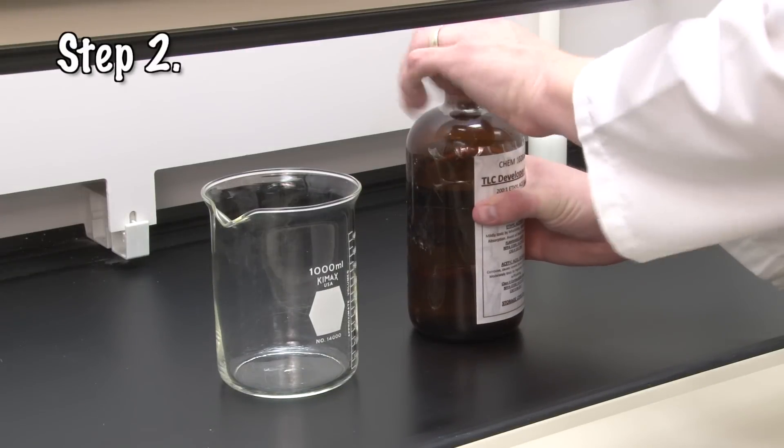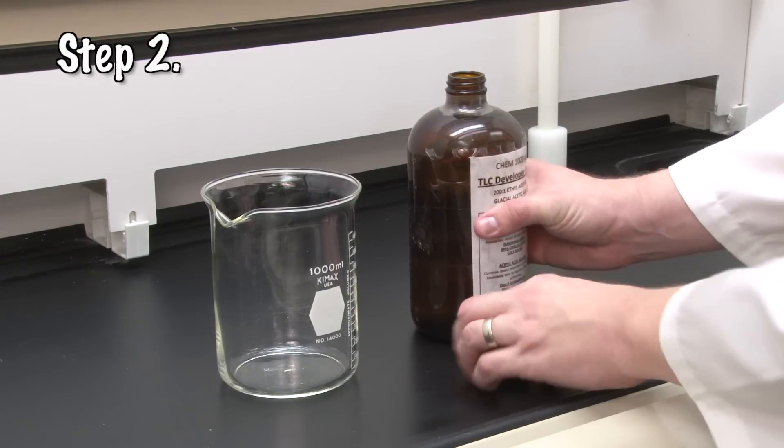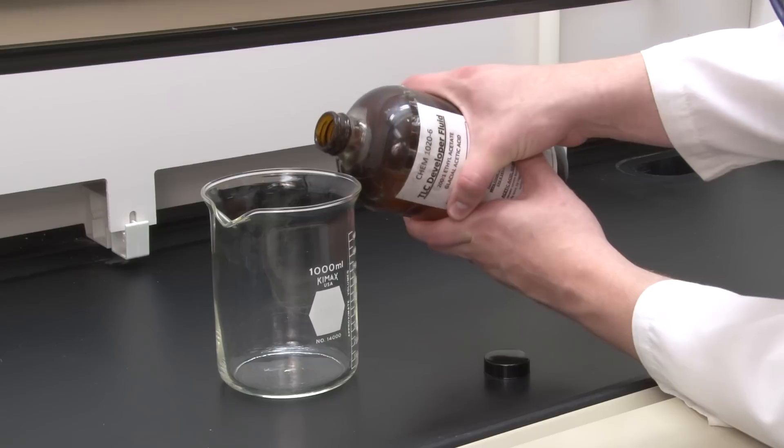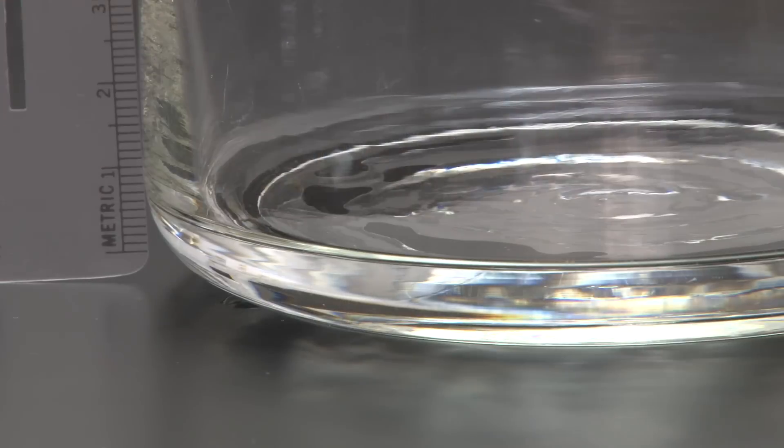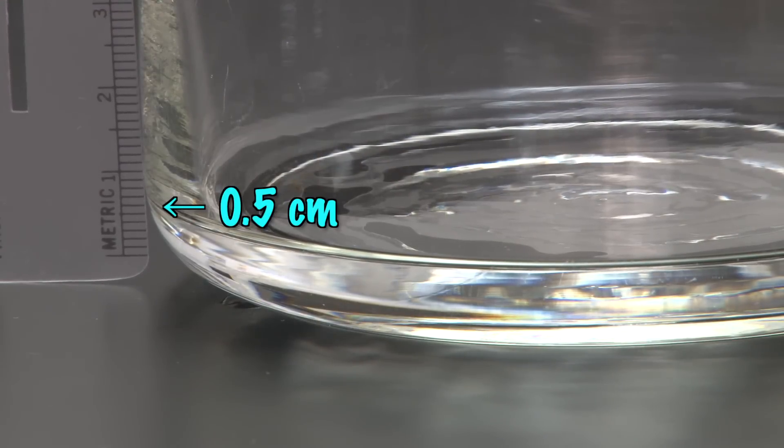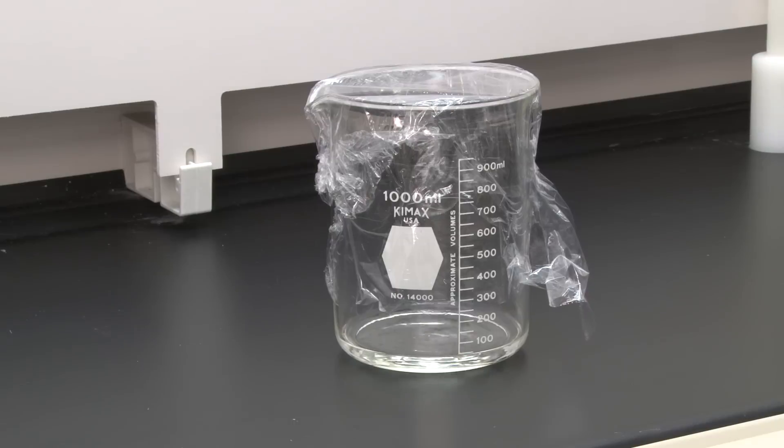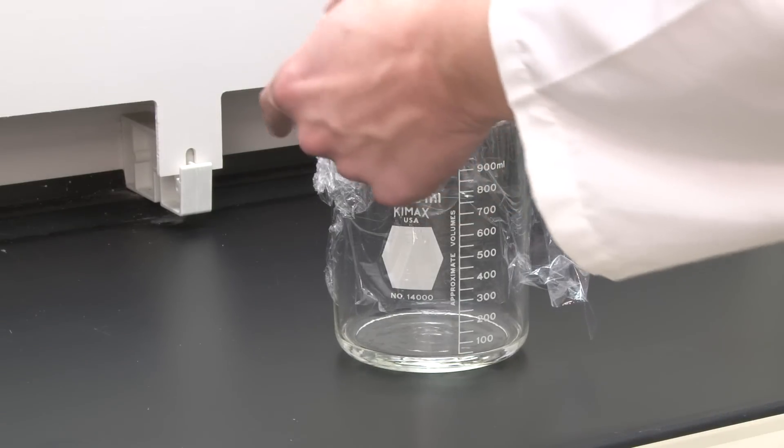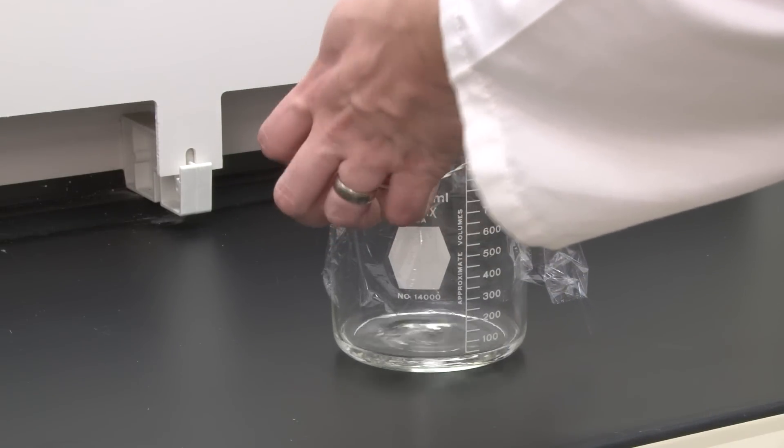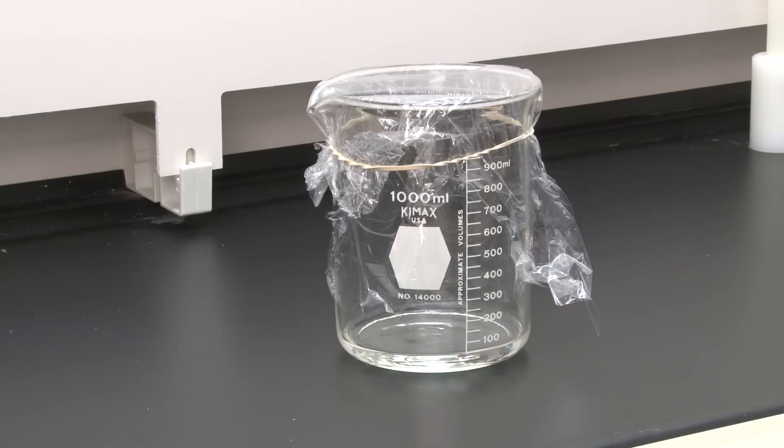First, you'll prepare a developing chamber under the hood by pouring a pre-made developing solvent mixture into a 1-liter beaker to a depth of about a half a centimeter. Cover the beaker with plastic wrap or a large watch glass. When the container is airtight like this, the solvent vapors will fill the chamber and the developing process later will work much better. Set the chamber aside under the hood for later.